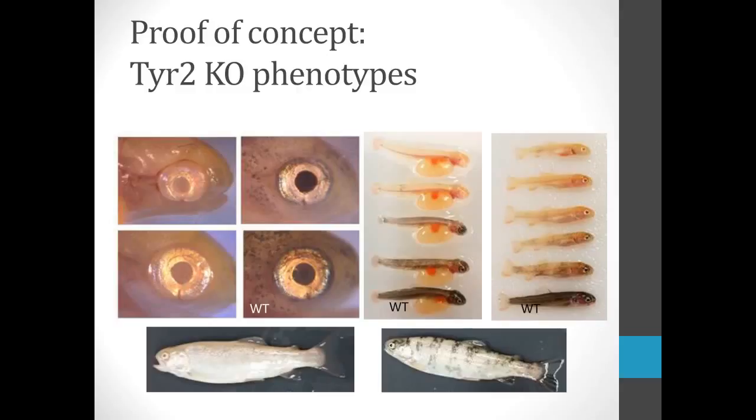So our goal is to make sure that we can achieve germline transmission and produce triploids as well. So these fish were produced last year, and our breeding population is starting to produce eggs now, so we are targeting our genes of interest in the next month.